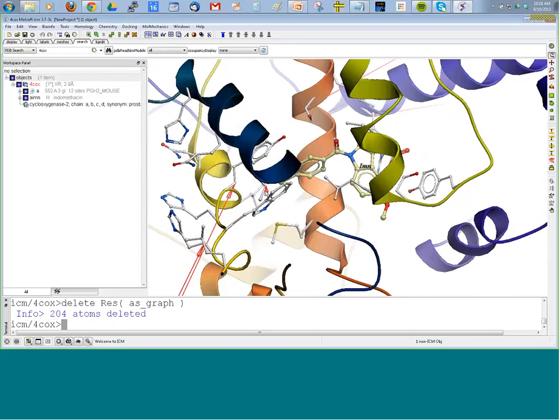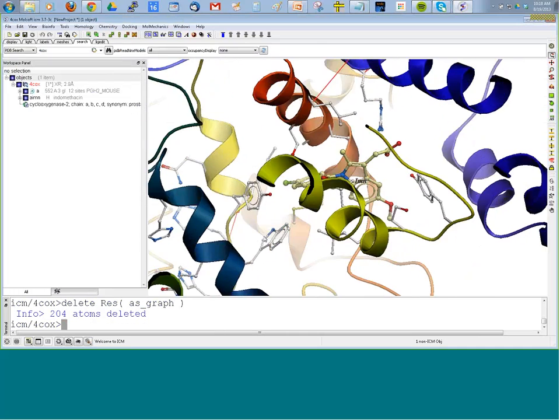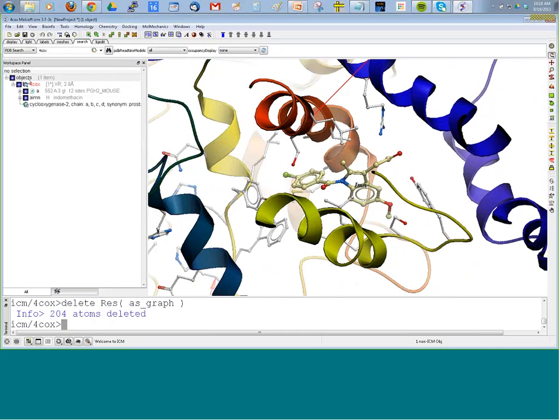The most important thing when you're setting up the project is to make sure that the ligand is out of the pocket. Here we have one object with 2 molecules inside, so we need to move the ligand out. If we don't move it out, then the ligand will be incorporated in the maps, and so there won't be any space there to dock to.